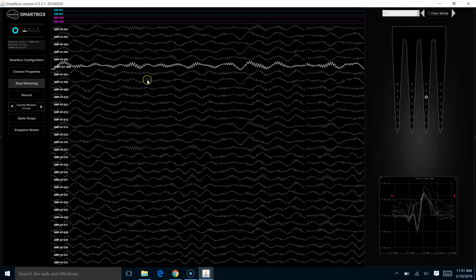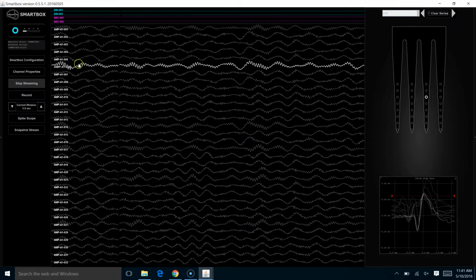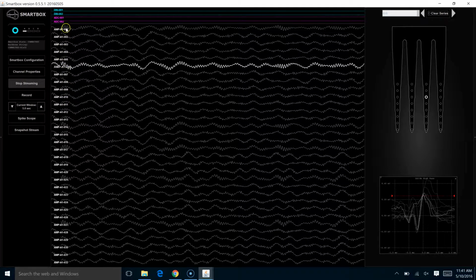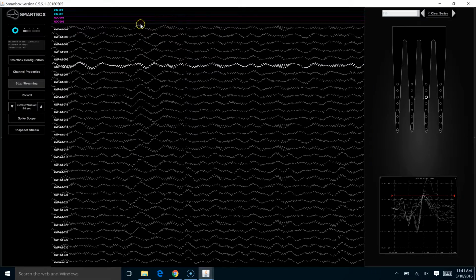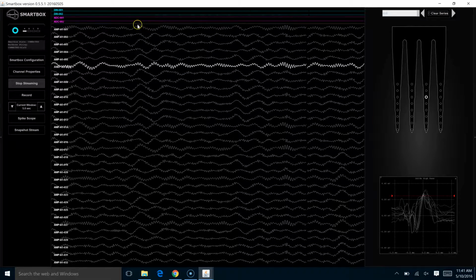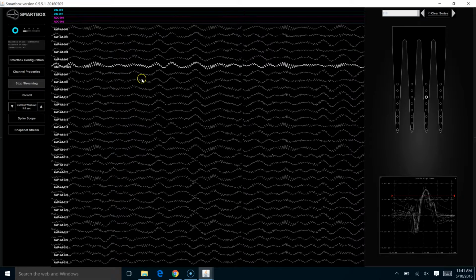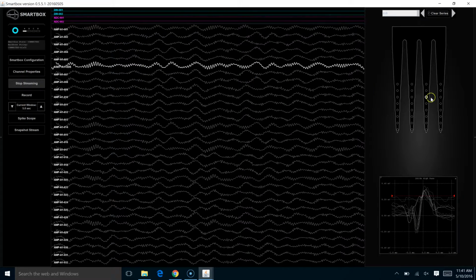So in our panel 2 spike traces, instead of being ordered 1, 2, 3, 4, 5, 6, 7, 8, 9, we wanted to order them such that each shank was numbered from top of the shank to the bottom of the shank in order.